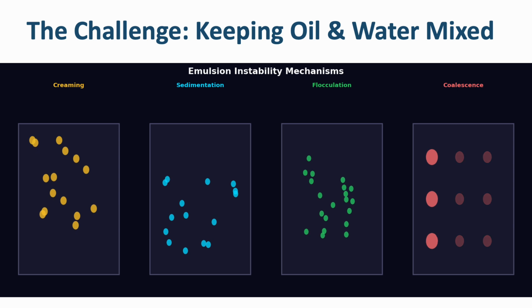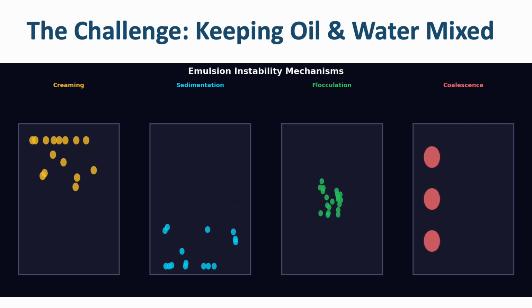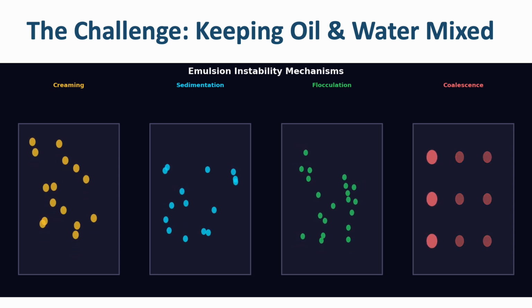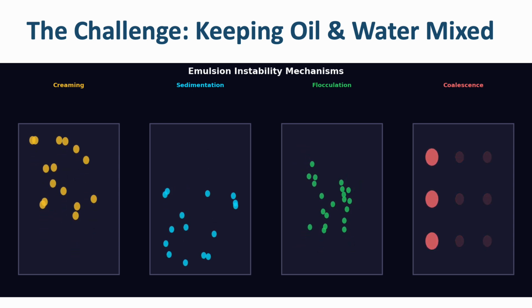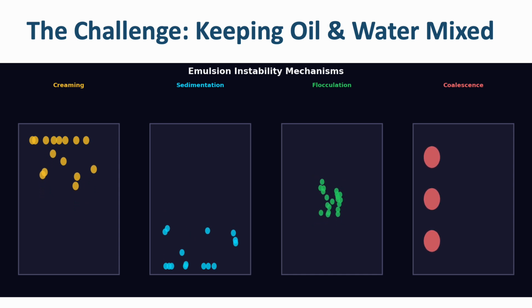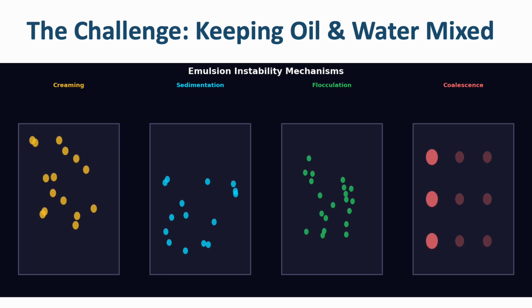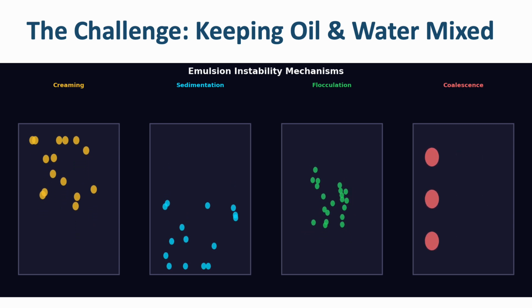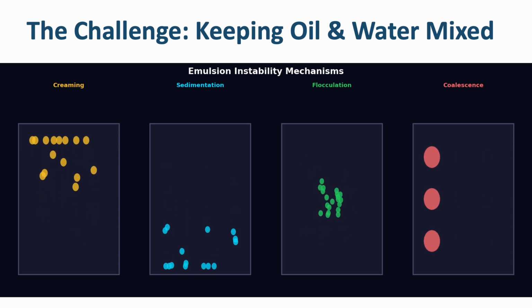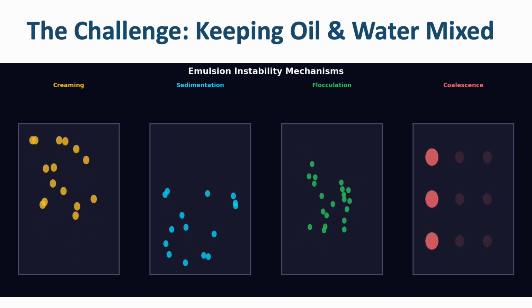There are challenges with forming good creams. So here, as is shown in this animation, these are common problems that can happen. As you can see here, creaming is where you start to see the oil separation, and that just migrates to the surface. The opposite can happen as well when you have sedimentation, and that is just because of the gravity, the components can separate. Often it is the water, the aqueous phase.